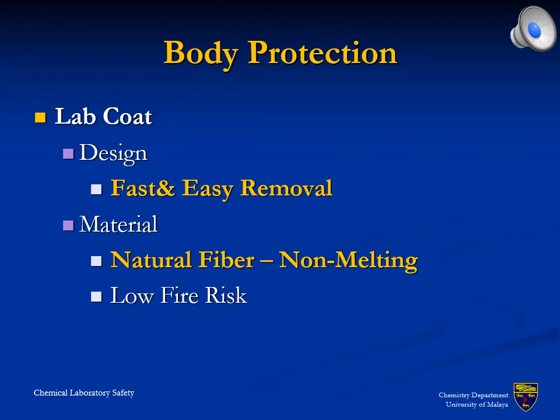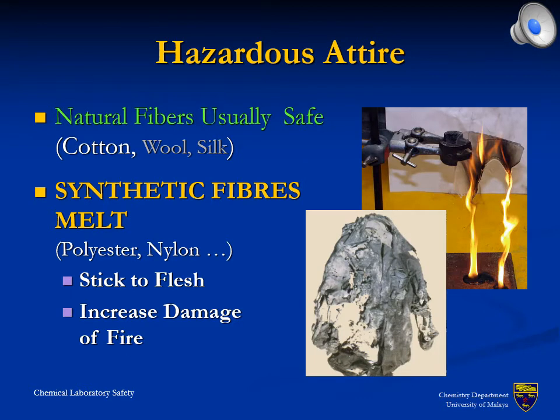Moreover, the material is selected from natural fiber, which reduces the hazard in case of fire. Natural fibers, particularly cotton, are not fireproof, but they burn only moderately and leave a brittle ash network. This behavior substantially deviates from synthetic fibers, which catch fire more easily and typically melt upon fire exposure.